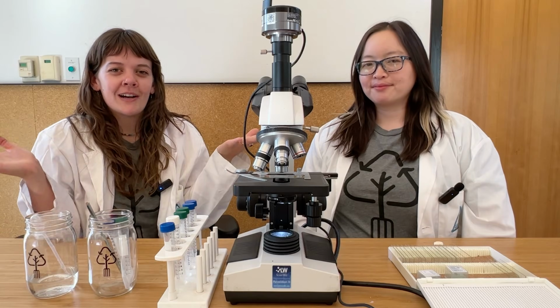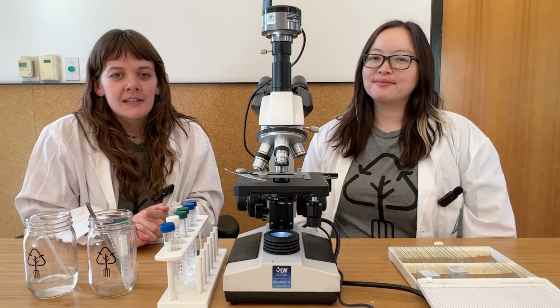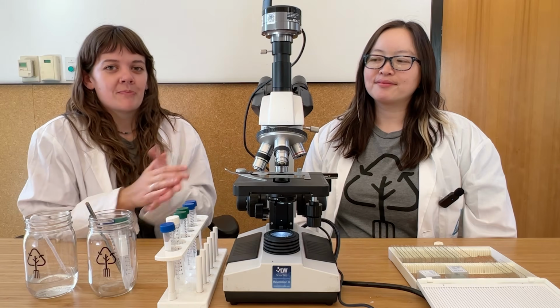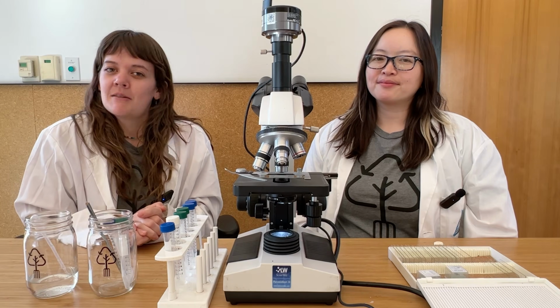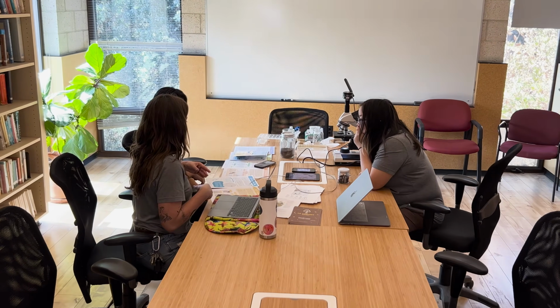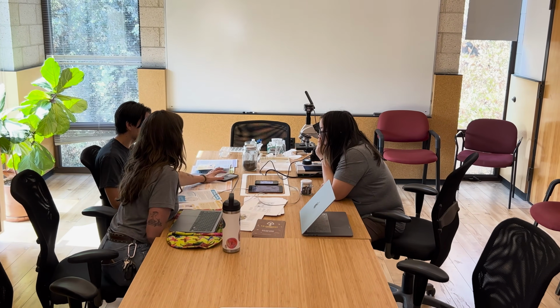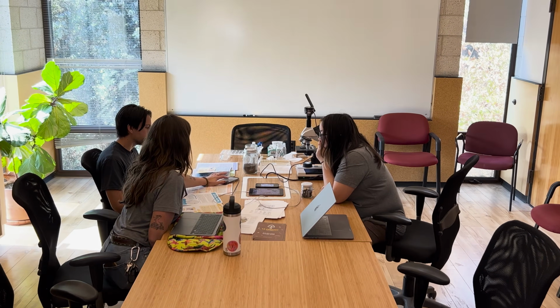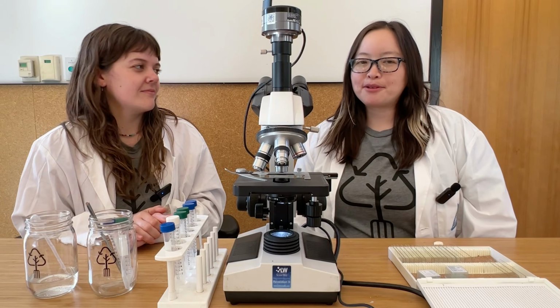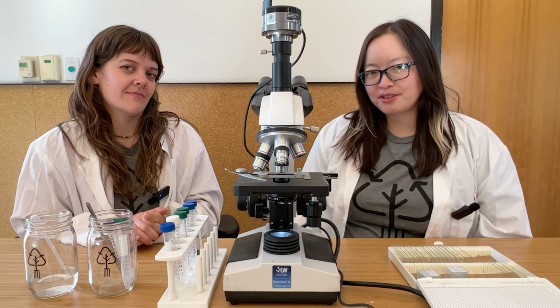But what even is microscopy? It's okay if you can't say it the first few times. Microscopy involves using a microscope to observe and study objects that can't be seen with the naked eye. Studying a soil sample through microscopy allows us to visualize the microbial profile present in a sample and consider whether it supports the targeted end use of your soil or compost. It also offers an opportunity to reflect on how your practices influence the overall health of your site.